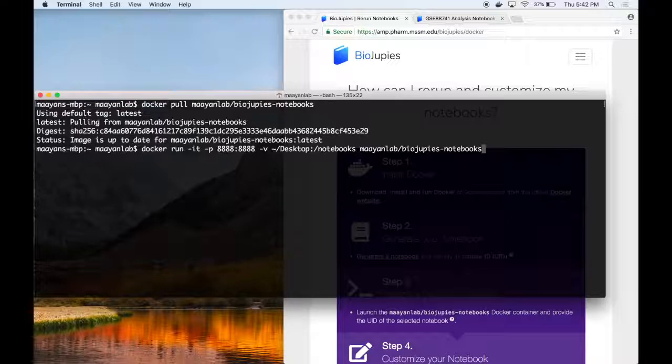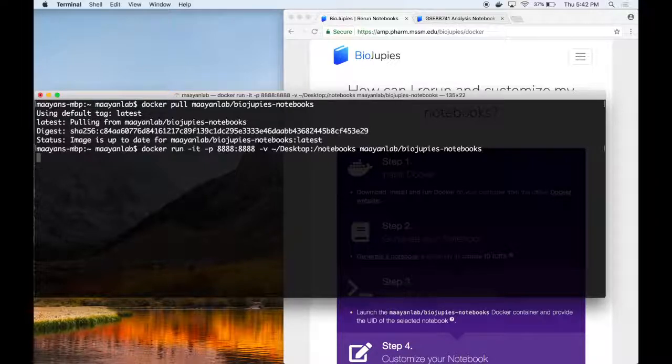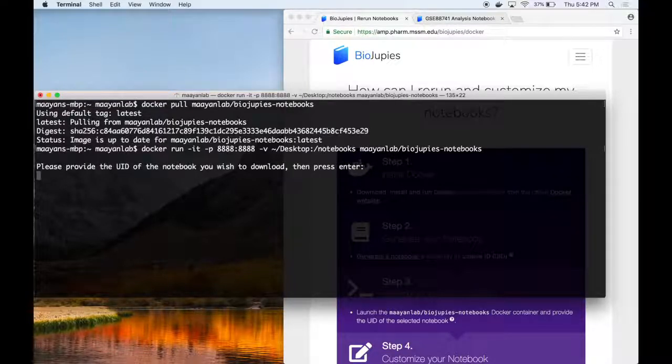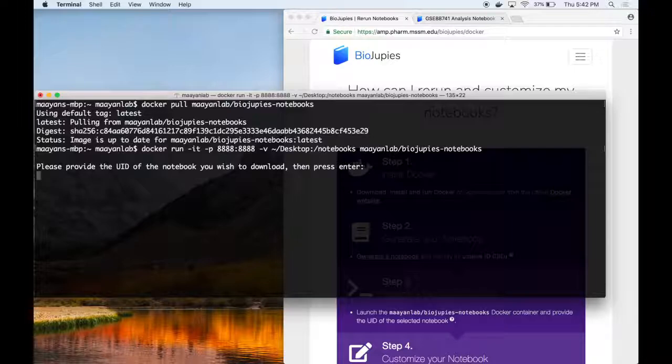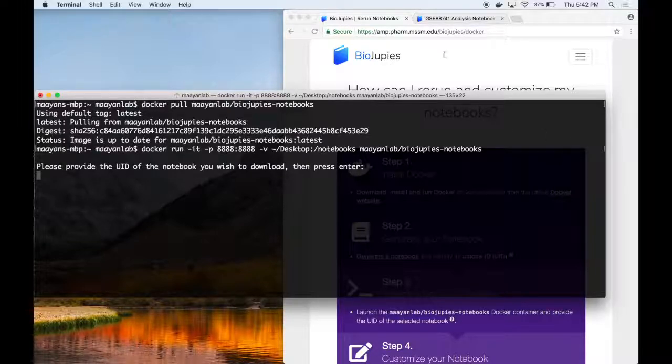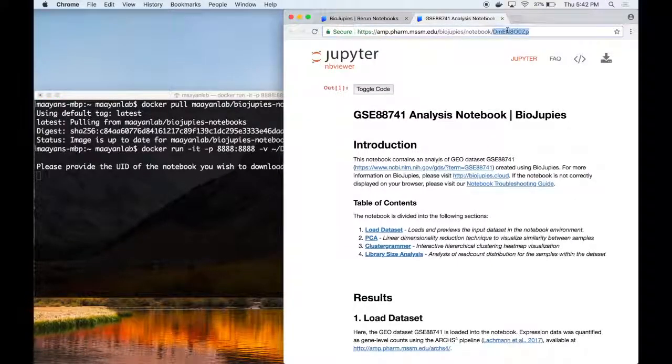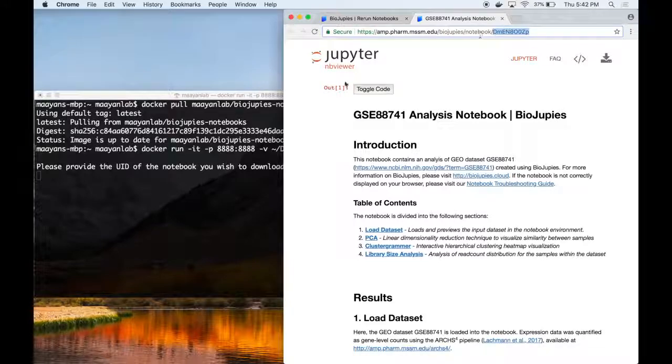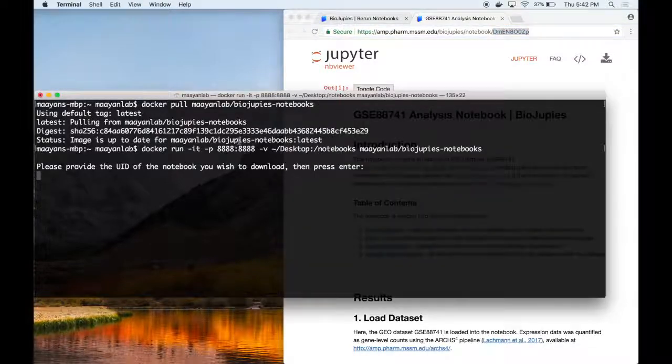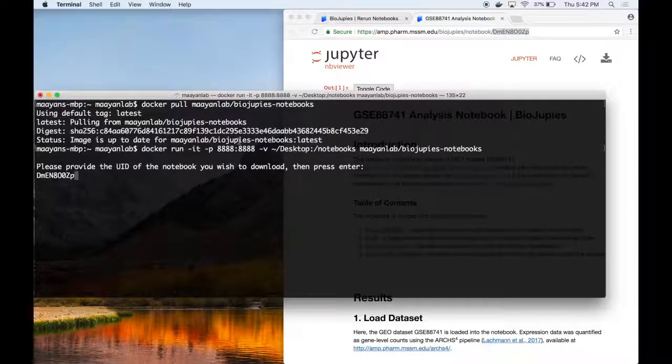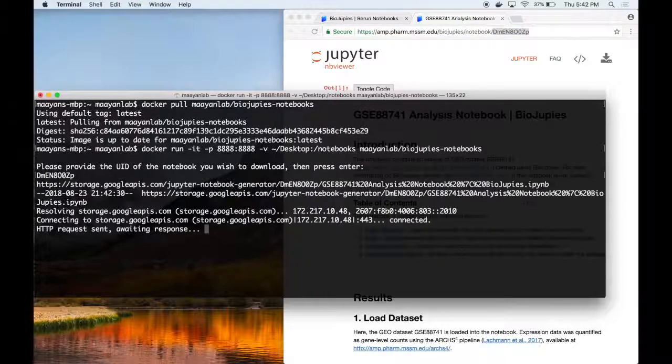After launching the command, the Docker container will ask you to specify the unique identifier of the notebook you wish to download. So in this case, we can copy the UID of the notebook we identified, go back to the terminal and paste it and followed by enter.